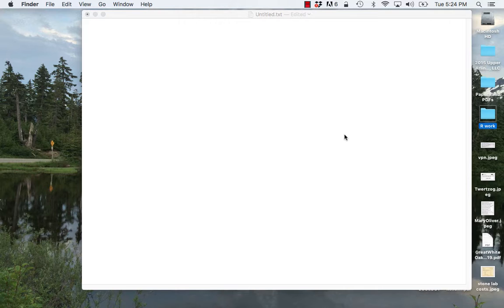So the first thing you need to do is to make a folder on your desktop that's going to be your working folder for R, and you're going to put your data files in there first. So you'll want to download from Google the shared Google file so you can analyze the entire class data set. So by now there should be Group A, Group B, and Group C data all entered into the same spreadsheet. So it will probably end up being over 120 rows long, where the Group A data is stacked over the Group B data is stacked over the Group C data.